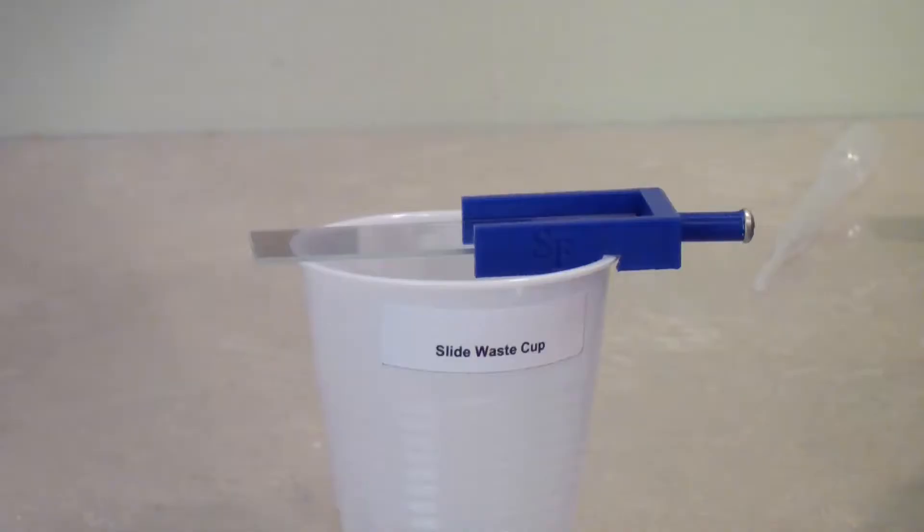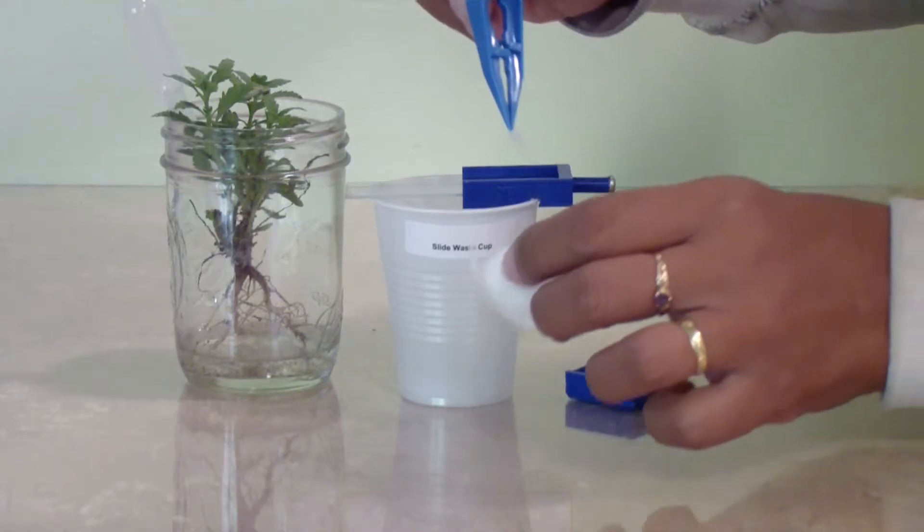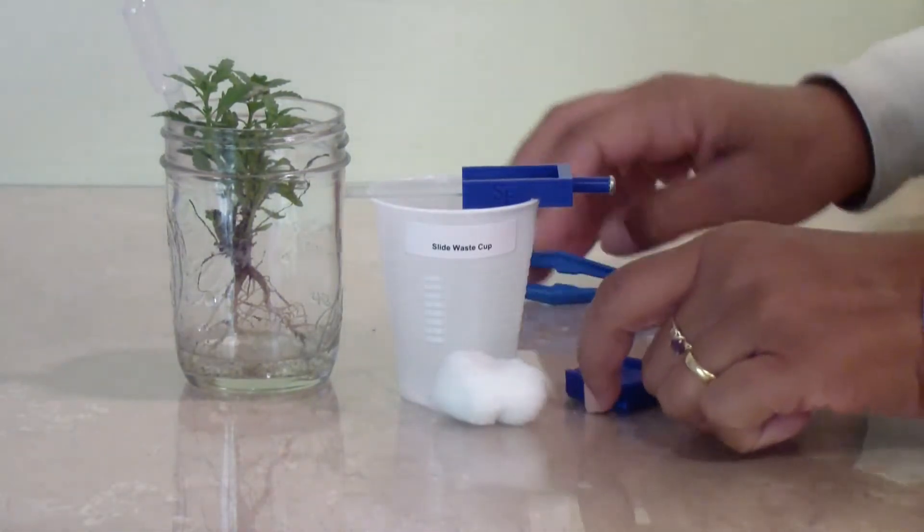Insert the slide into the slide holder and place it on the waste cup. With forceps from your supply box, place a small piece of fiber from the cotton ball in the center of the glass slide.